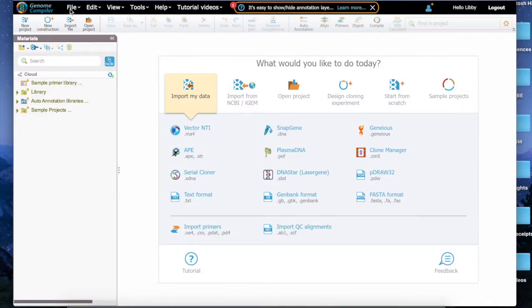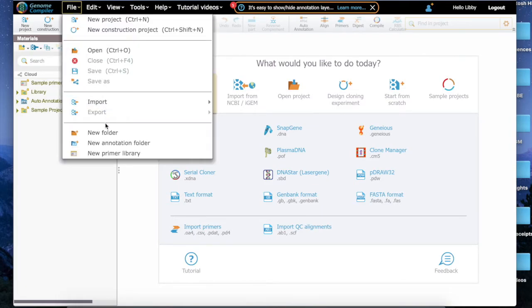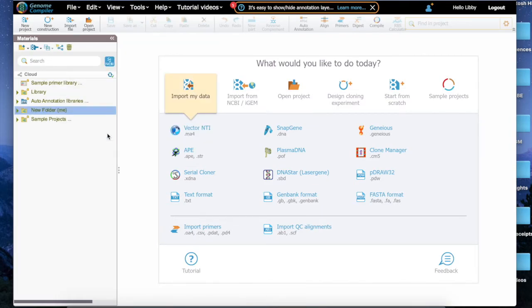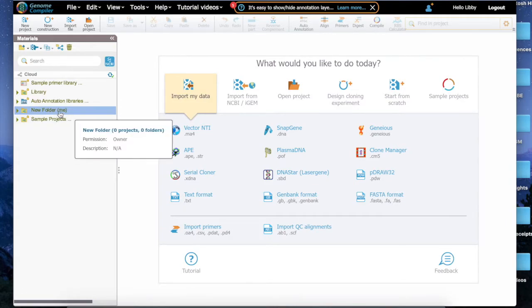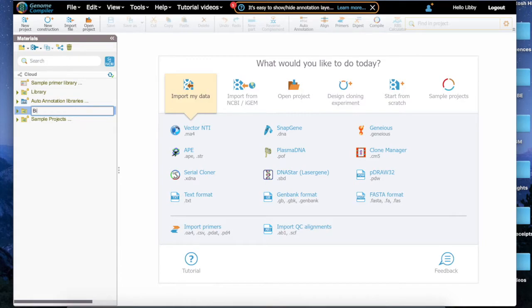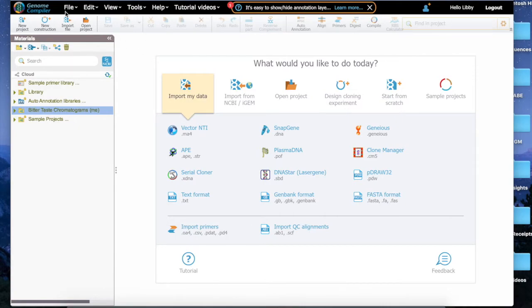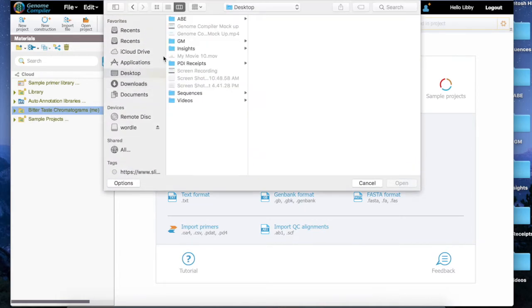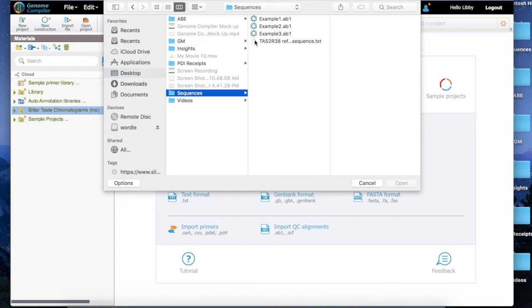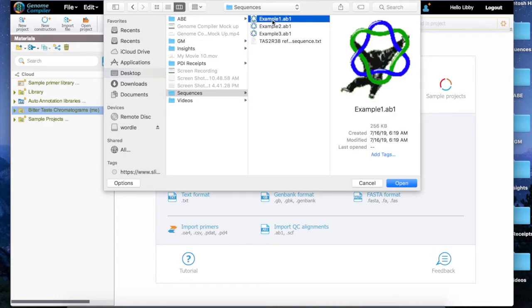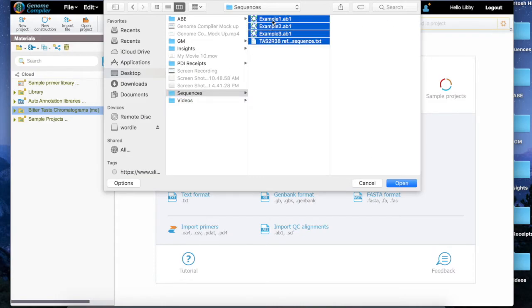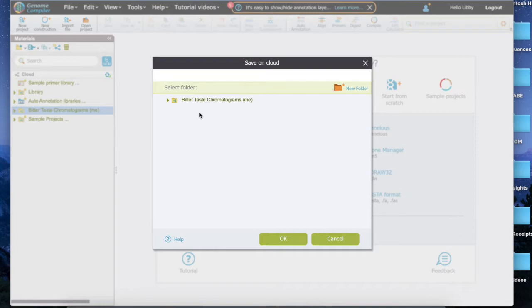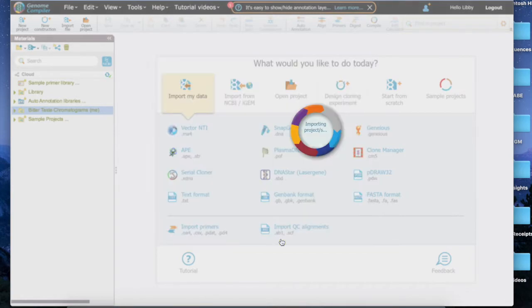First, we're going to upload all our sequence files. Click File and then click New Folder. A new folder will appear in the sidebar. If you want, you can rename this folder by right-clicking or control-clicking if you're on a Mac and selecting Rename. I named mine Bitter Taste Chromatograms. Now I need to fill the folder with the sequences I want to use. Click the Import File button in the upper left corner of the screen. It will ask you to find the sequences you want. Mine are on my desktop, so the folder is easy to locate. Select where you want to store the files, which for us is the Bitter Taste Chromatograms folder I just made.